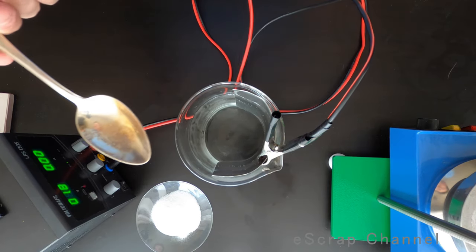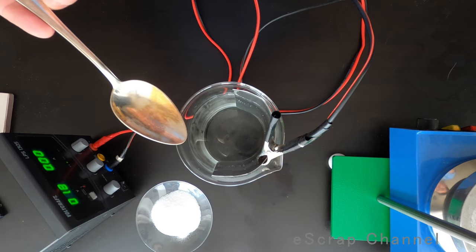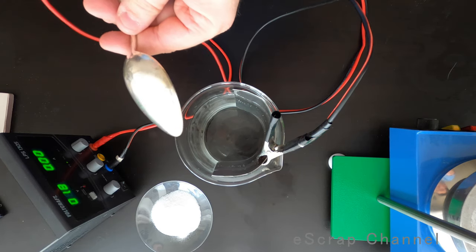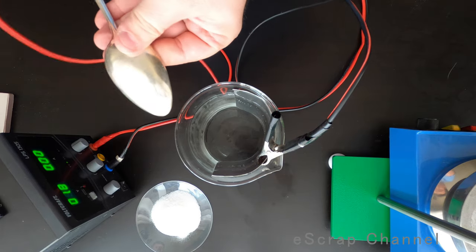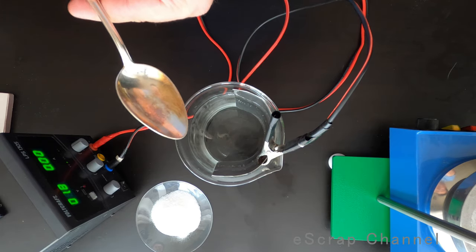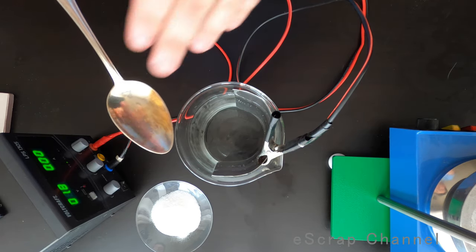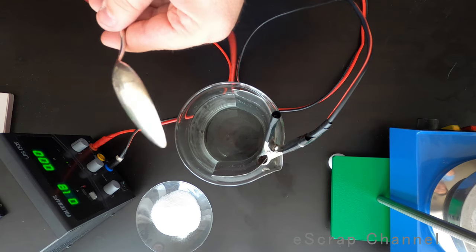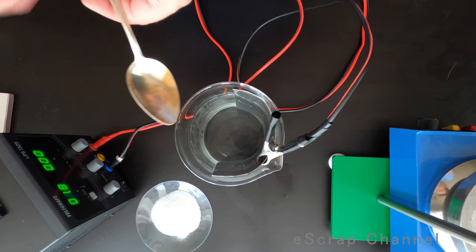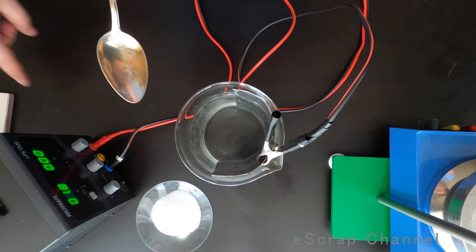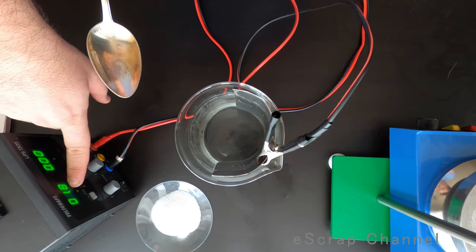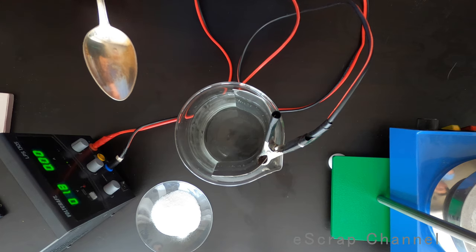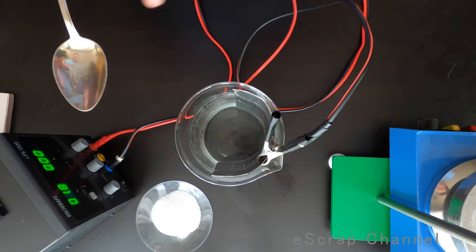So I have this silver spoon, silver plated. It's quite thick silver plating on it and how I will remove this silver from this spoon. I can use reverse electroplating. This is my power supply. It's set on 1.8 volts and I think it's fine.